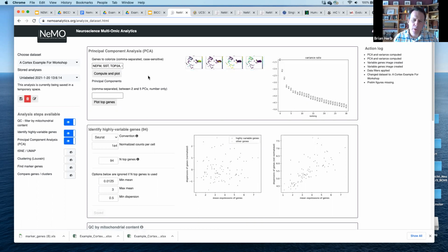kind of get a sense of the data set, since you're expecting certain cell types. You can check that along the way as you're making progress. This second one will show you what are those genes that are driving the top PCs. Okay, so if we calculate our PCs, our data frame is now variable genes by PCs.